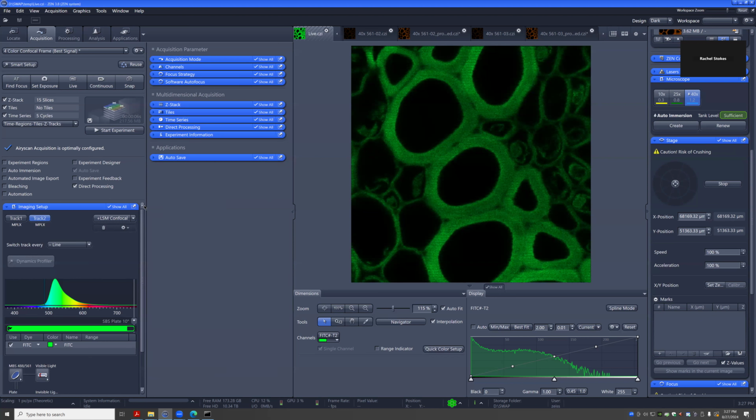What I recommend too, when you're starting out, what we see helps a lot is to go to the system with someone else too, so that if you're trying to figure something out, there's someone else that can remember things that you can't, and the other way around. I think that's always been pretty helpful, especially in the beginning. And then write things down that you run into.